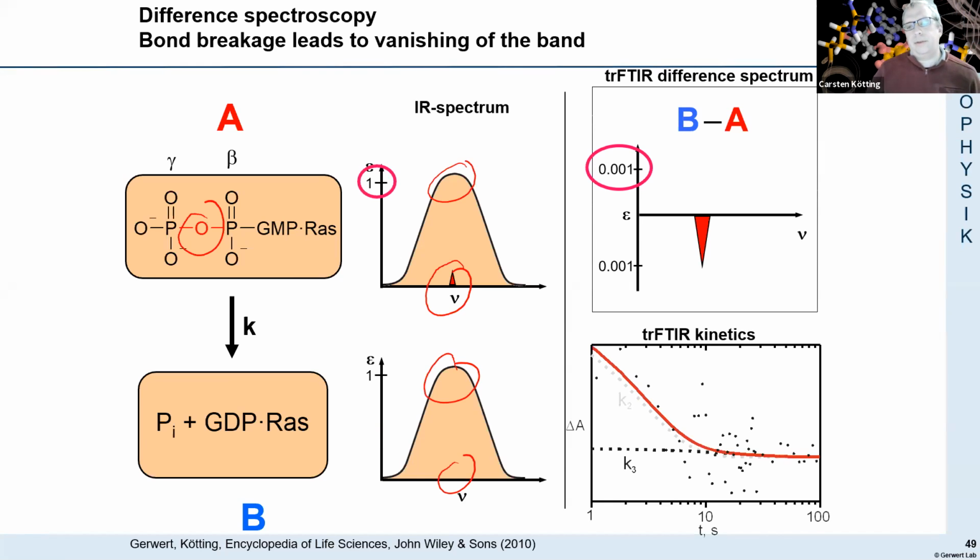And obviously, you can also do this time resolved and look at this absorption time resolved, and by that, for example, investigate how fast this hydrolysis reaction proceeds.